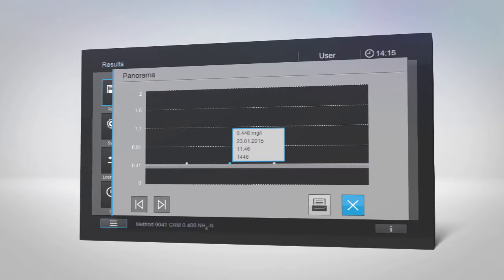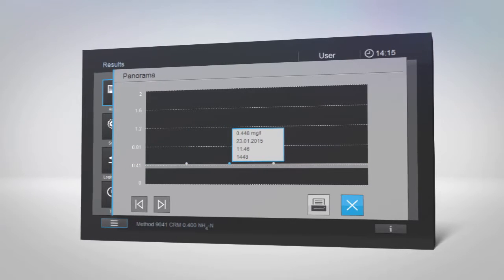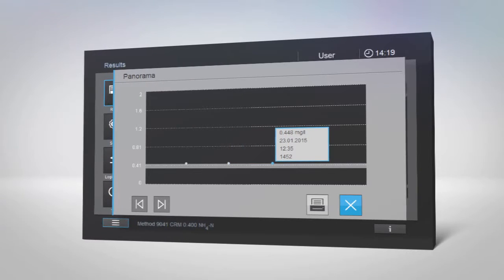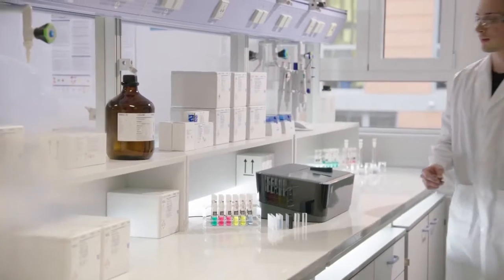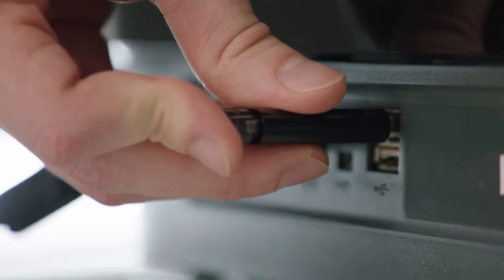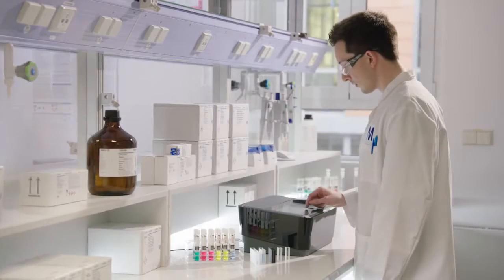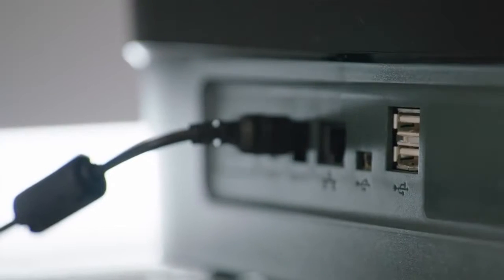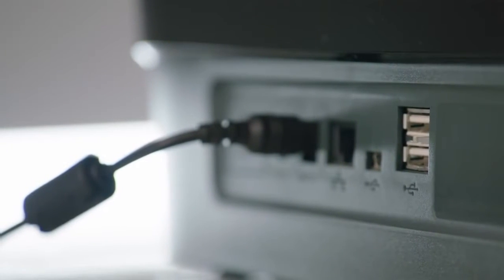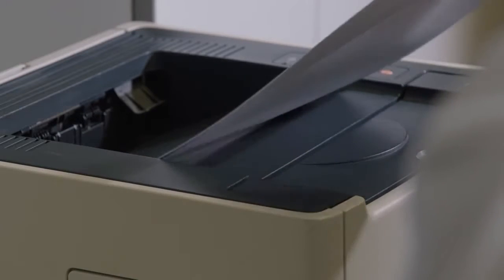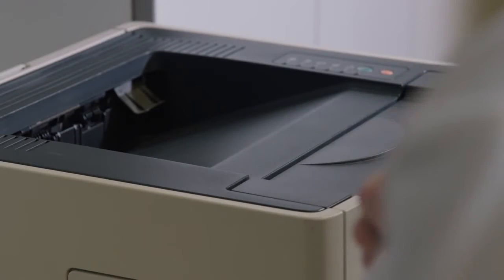With SpectraQuant Prove, you won't need a data mining program to transfer data. The instrument will do it for you with a few simple taps. After you select your required data, simply insert a USB device into SpectraQuant Prove and tap the Export button. Your data will be automatically transferred to the device. To print your measurements, just connect your printer to the instrument and tap Print. SpectraQuant Prove makes data transfer incredibly fast and easy.